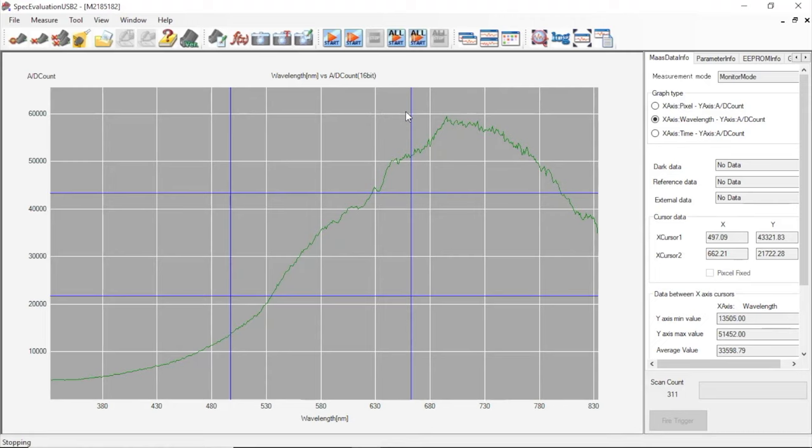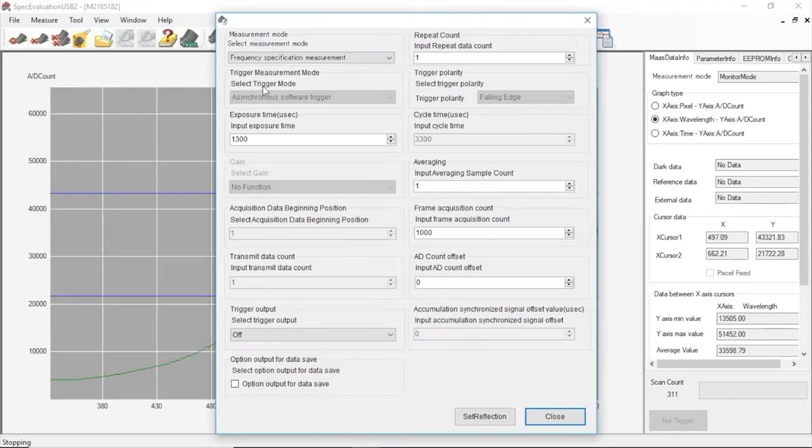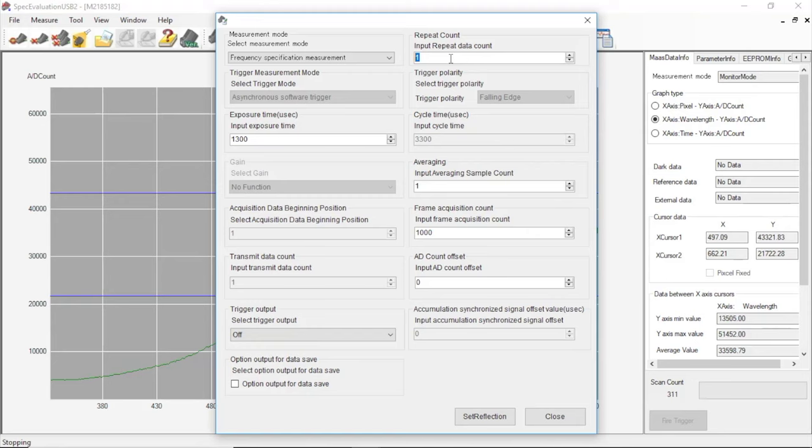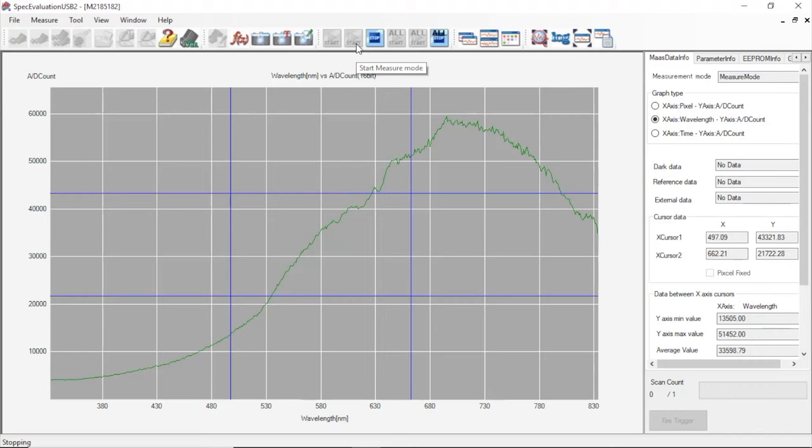We need to take a dark measurement to give us baseline information on the dark noise. We'll start by going back to set parameters and setting the number of repeat counts. This will be reflected in the saved data as the number of scans or columns of data saved. We'll set this value to 1 and then we'll set the average values to 100. So this means that the one dark scan that we measure will be an average of 100 scans. Now with the shutter on our light source closed, we'll click this button to take a measurement.